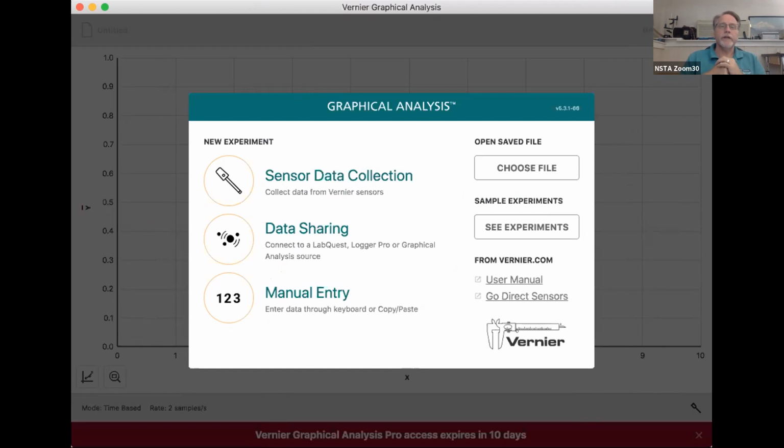We've downloaded the data, and so what we need to do is take a look at what the lab's about. And so the one I looked at was the cell respiration using the CO2 sensor and the O2 sensor. So it's using two sensors together. And the idea is that the students, once they have this data, can go through and answer the questions and do the analysis and whatnot that's required. So let me do that.